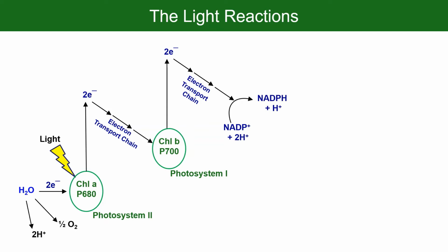Here's a summary of the light reactions from your lab manual to show you how today's assay will work. So there's lots of ways to measure photosynthesis. We could measure basically the end products of photosynthesis. So we could measure oxygen, we could measure NADPH production, we could even measure, in theory, carbohydrate production. What we are going to do today is measure photosynthesis indirectly.